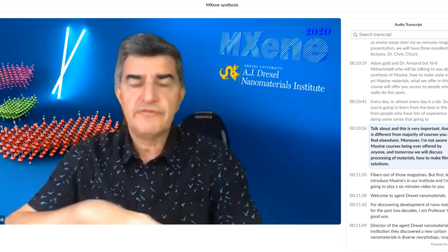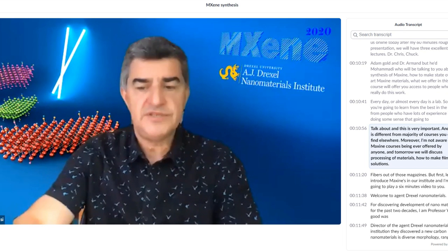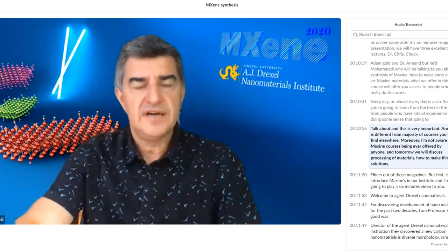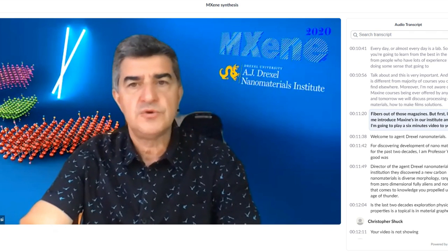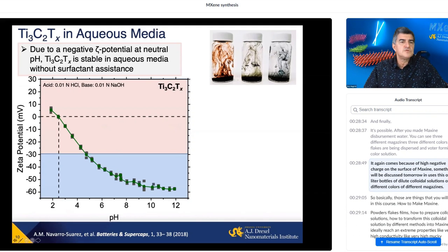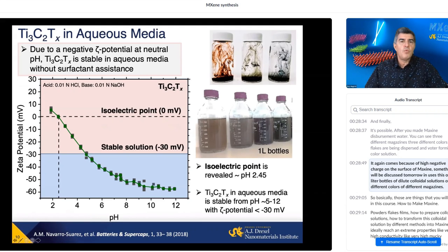And tomorrow we will discuss processing of materials, how to make films, solutions, fibers out of those MXenes. But first, we disperse them in water. You can see three different MXenes, three different colors, and flakes are being dispersed in water, forming colloidal solution. It again comes because of high negative charge on the surface of MXene. Something will be discussed tomorrow. And you see these 1 liter bottles of dilute colloidal solutions of different colors of different MXenes.